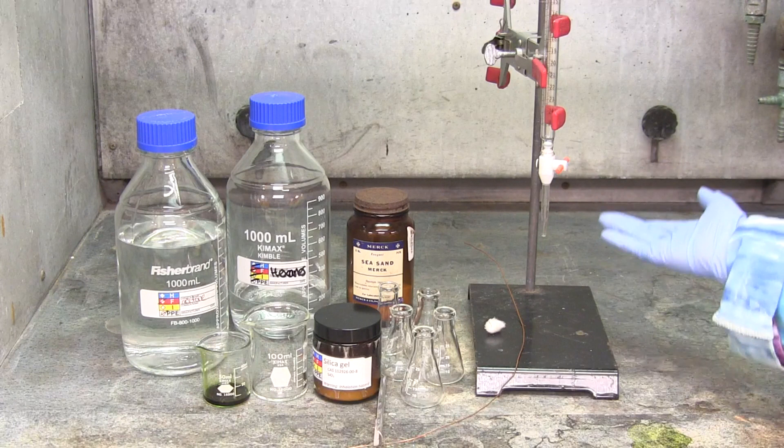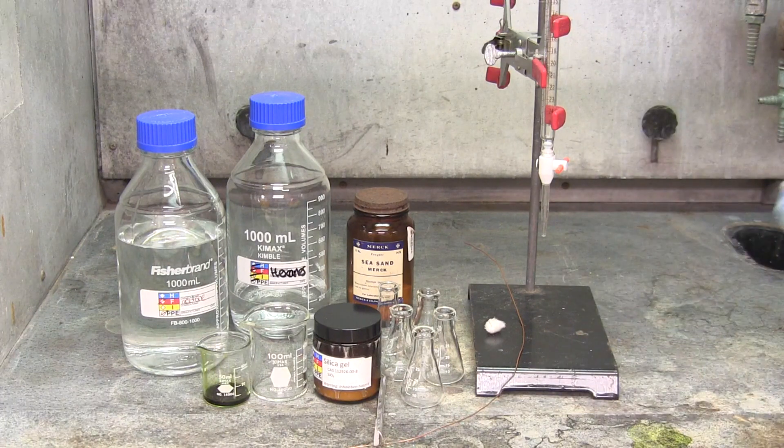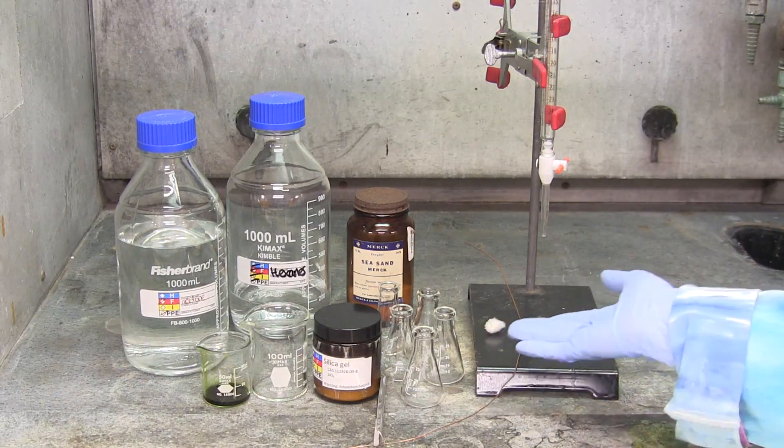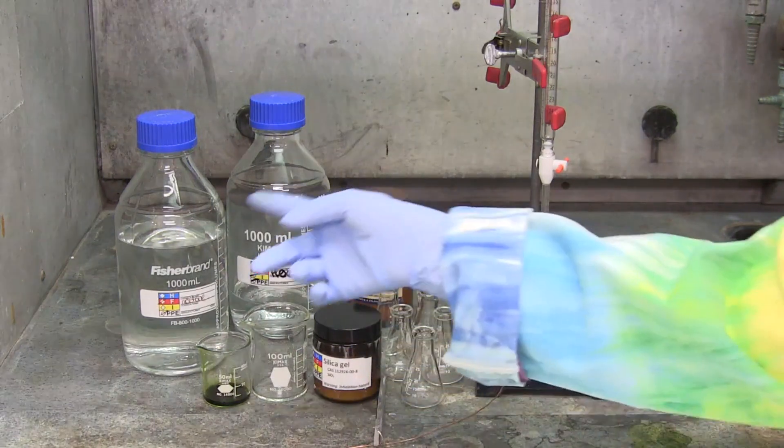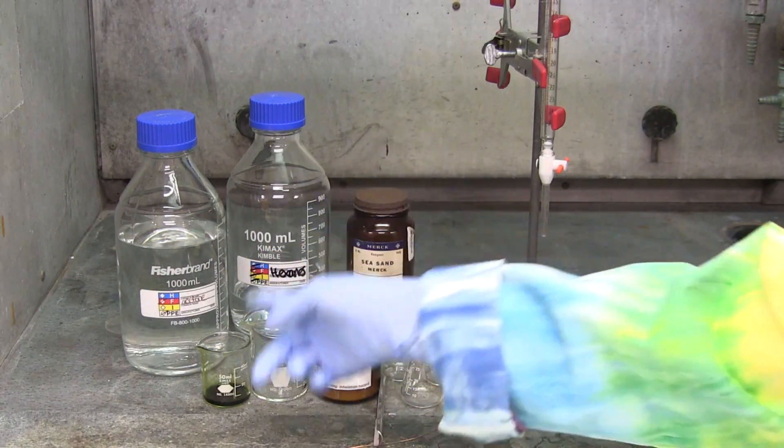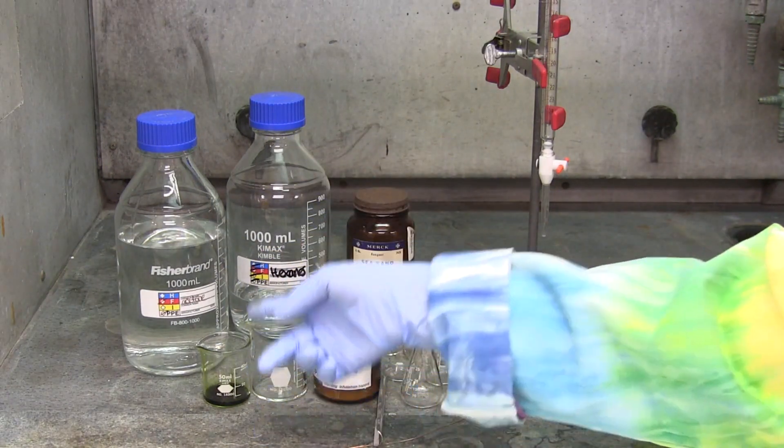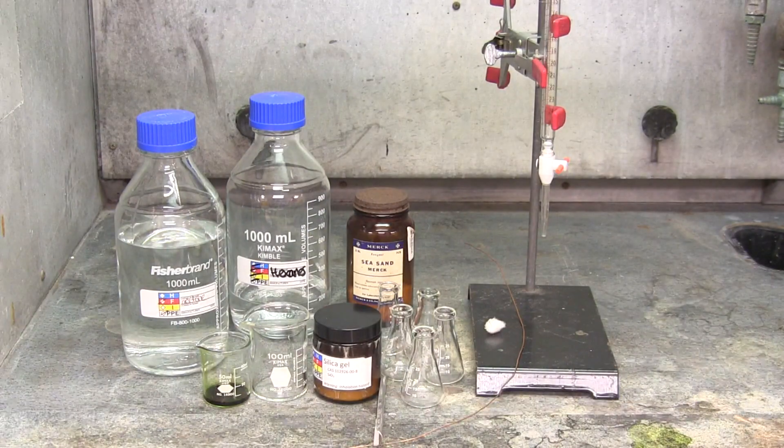The materials you will need are a burette, a stand, a copper wire, a wad of cotton, some small Erlenmeyer flasks, the two solvents acetone and hexanes, sand, silica gel, and the sample spinach.